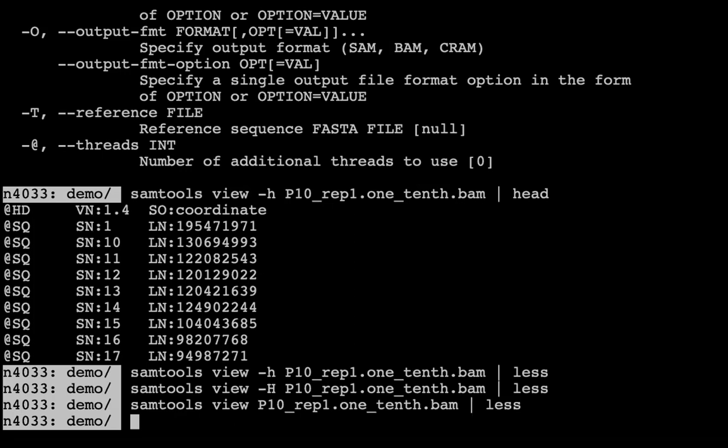And then colon, and then colon. So this has been changed to where the file is, and this address has to be the file you want to transfer, or the directory of the file you want to transfer. Then you can just drag it from here to there, or maybe there are buttons where you just transfer. There's usually a button to transfer things from that.